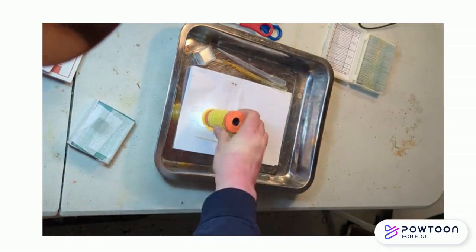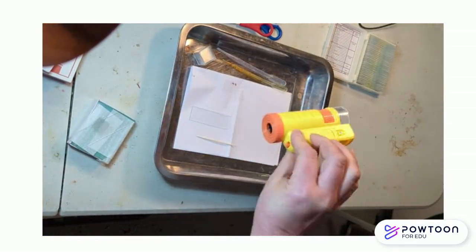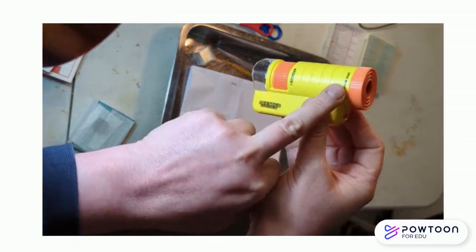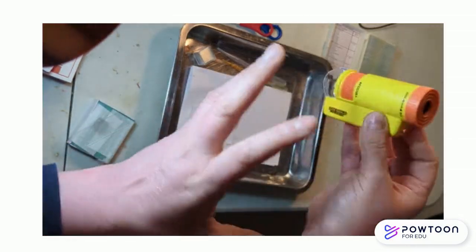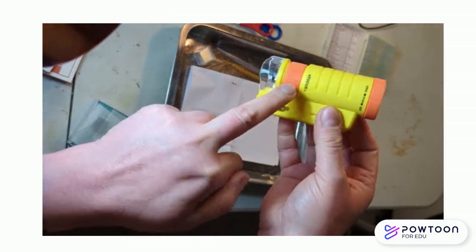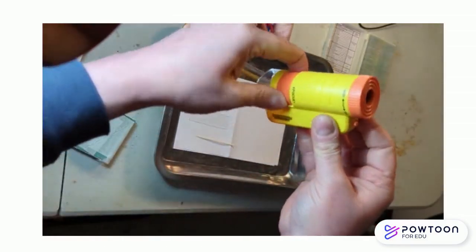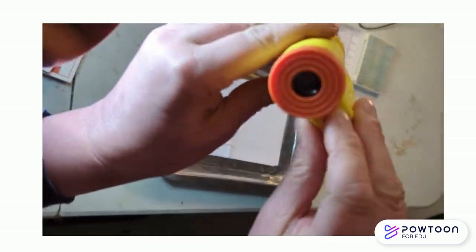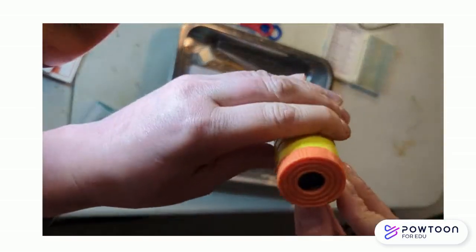So this is really the basics, both for juniors and seniors, of how to use a microscope. Magnification, so how big you want the image to be. And focus. That focus really speaks for itself. Don't forget to switch on the lights, and off. On, off. And that's about it.